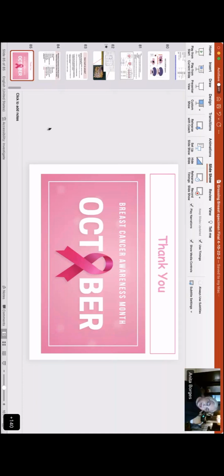Some people measure skin size, other people also measure the weight of a mastectomy specimen. The reason for doing this is that you have lost this much skin. This is really more important for the surgeons, who do it in the operating room. For us, it is about documentation, that you have had this much skin and this is the weight of the mastectomy.